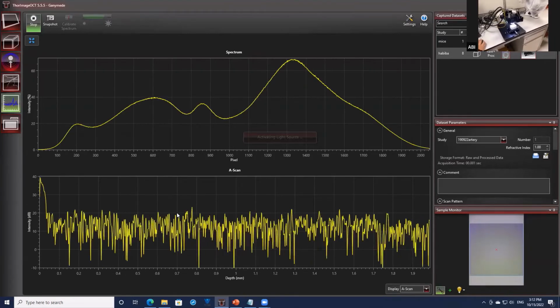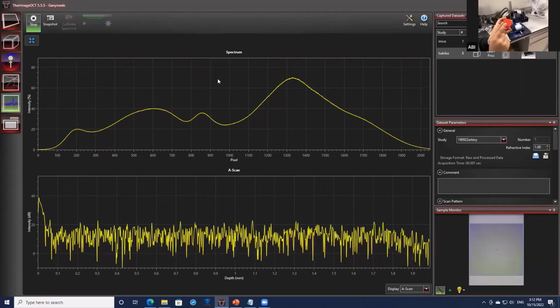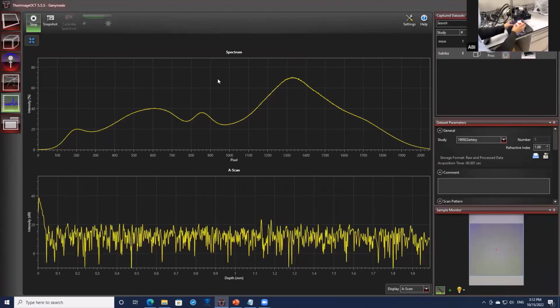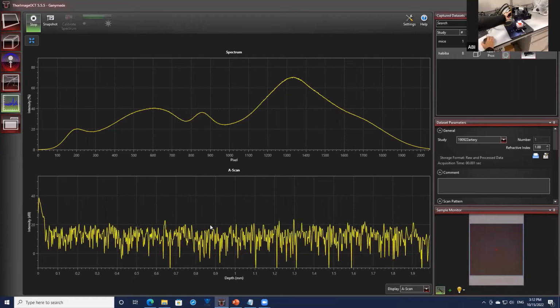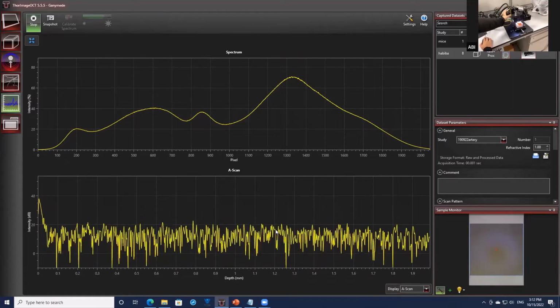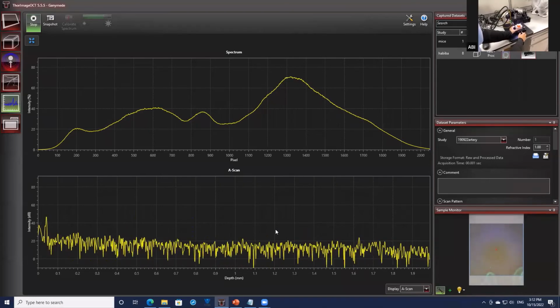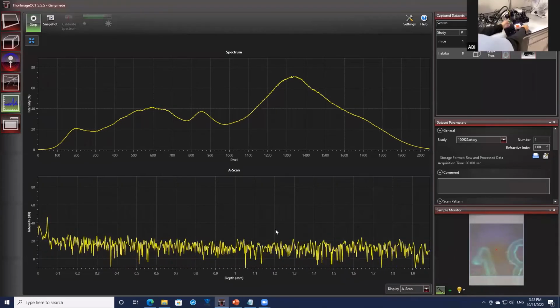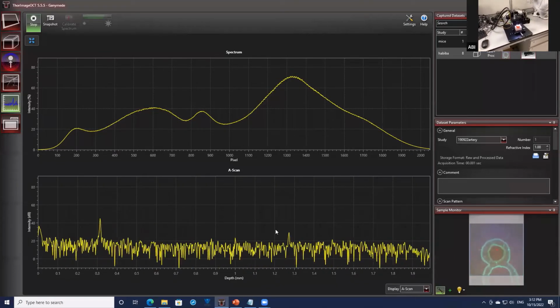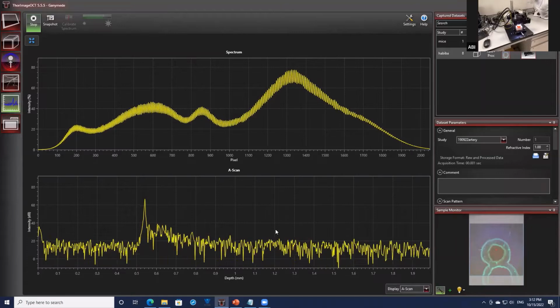So we'll wait. Yeah, so here, for example, this plastic cap, and it has some structures underneath it, so we have a certain depth in it. So, for example, here, we don't see anything, but when we try to adjust the length here, you can observe a peak. Yep, you can see a small peak here. You can see this number here, and then we can adjust the length. Yeah. So you can observe a peak here. It means that the light hits a structure. So there is one layer here. So this is a typical 1D data for OCT.